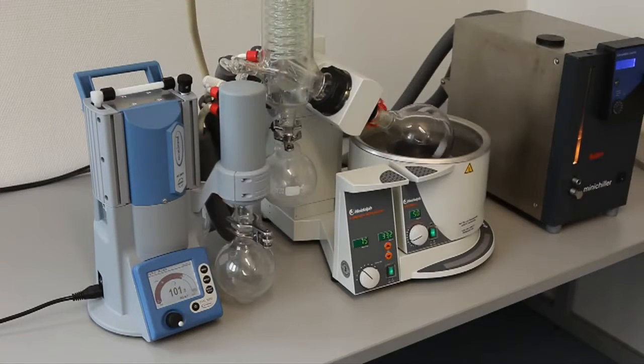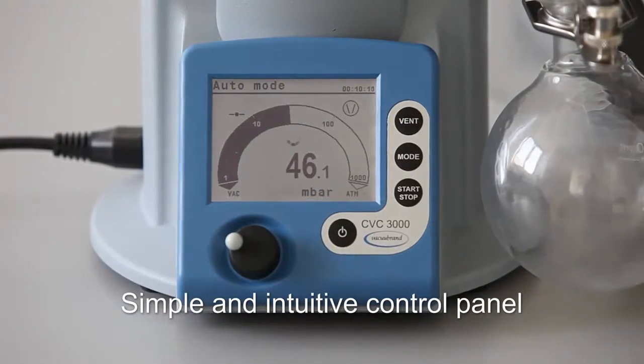The user benefits from faster process times without any need for pre-programming. More sample throughput per hour, with a simple and intuitive control panel.